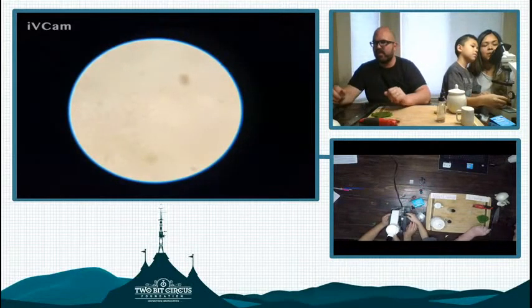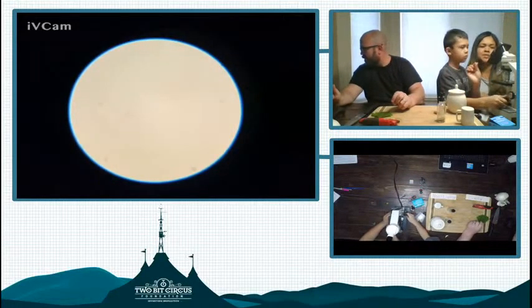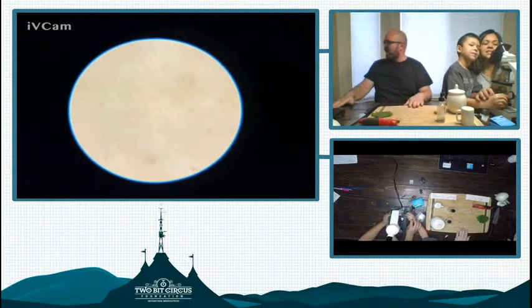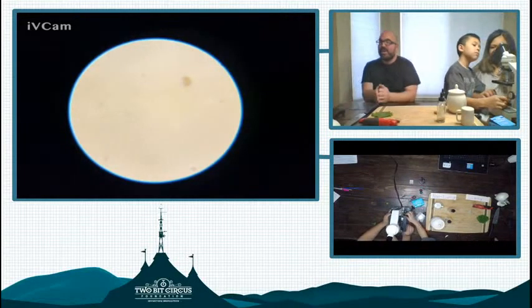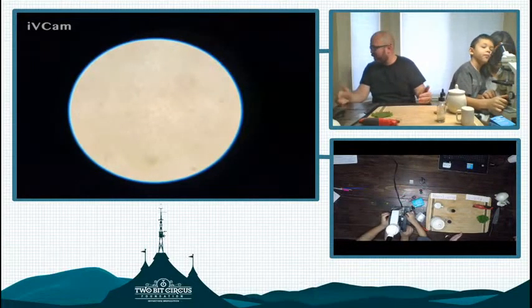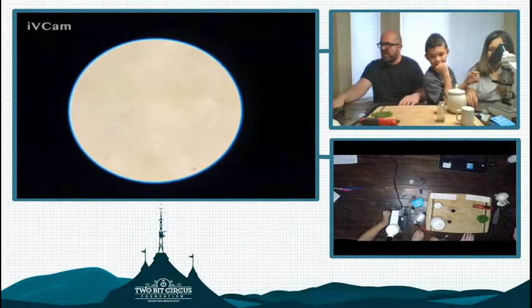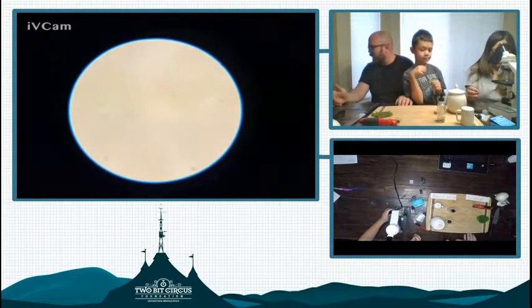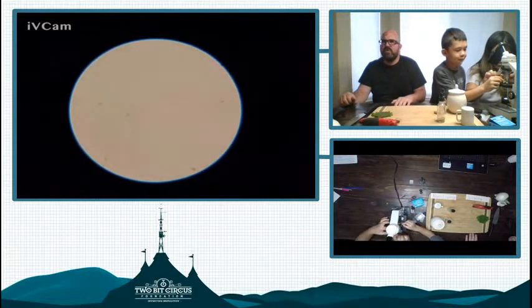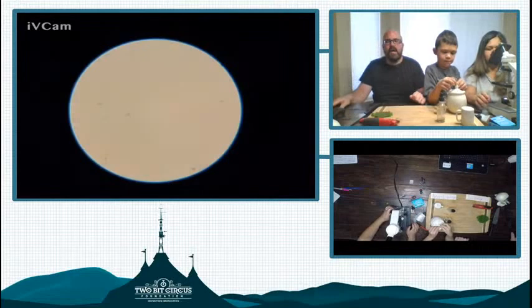Alright, so I know the image looks kind of blurry here, but right now they're focusing in at the different magnifications. Not too much. This is super tiny. Tiny, tiny movements. Oh, Andy and Ian, you can buy simple microscopes off of Amazon. They have a huge variety. You could have expensive microscopes that are a couple hundred dollars, or more affordable ones around $20 to $40, and you could do a lot of things with those little basic ones that I'm using here. Usually the magnification capabilities are exactly the same as the one I have on video right now.